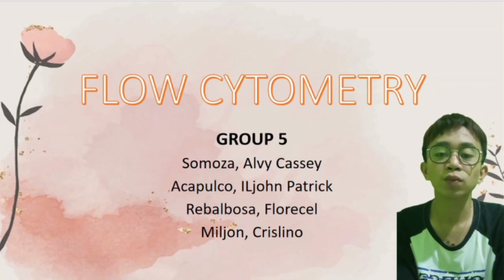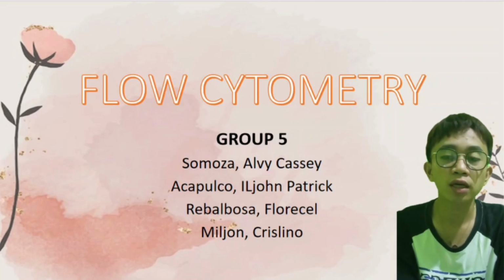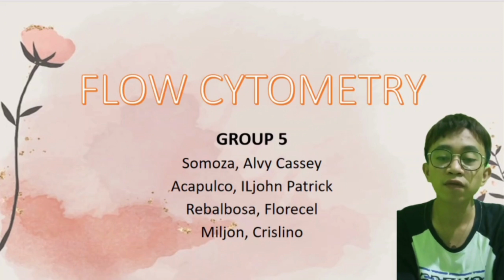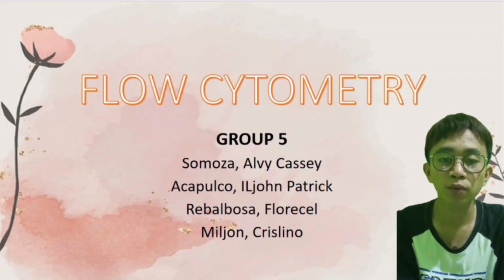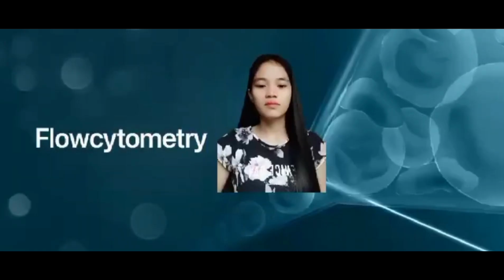Flow cytometry is widely used in research, clinical diagnostics, immunology, hematology, and various other fields to study and sort different types of cells in a high throughput manner. In short, flow cytometry is a technique for counting, examining, and sorting microscopic objects suspended in a fluid based on their optical properties. So as we've seen in the illustration, that's what a flow cytometer looks like.